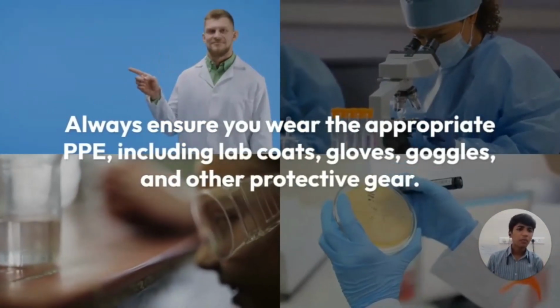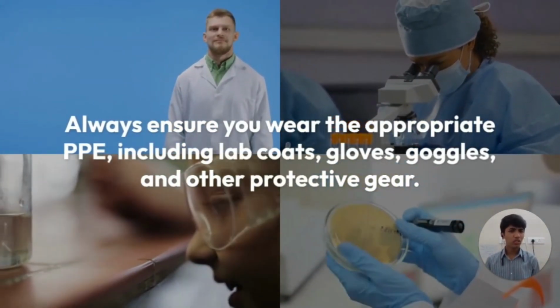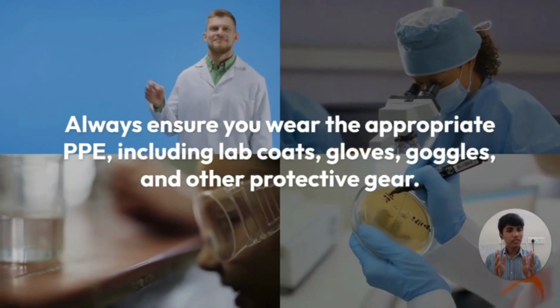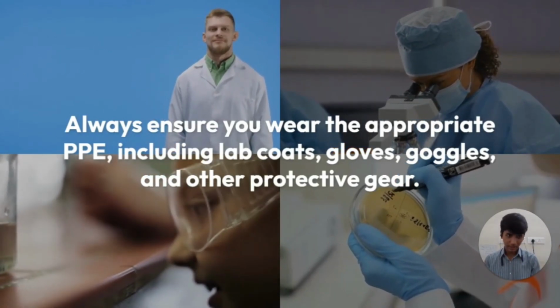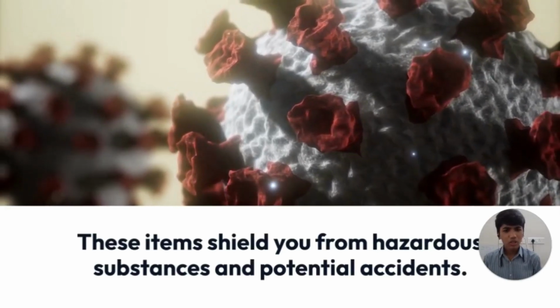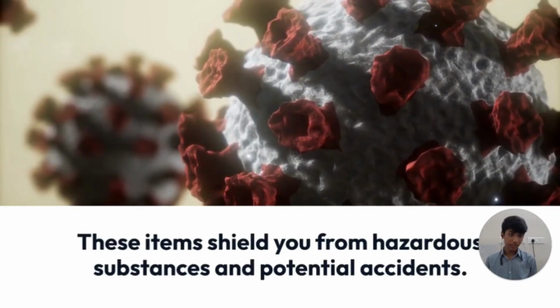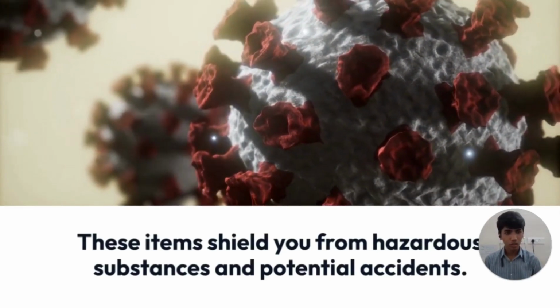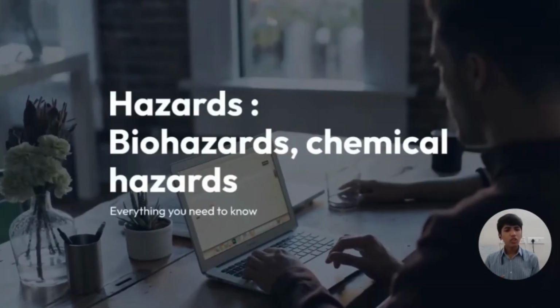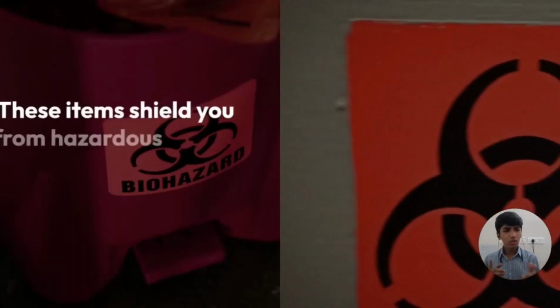Now PPEs. PPEs include lab coats, gloves, goggles, caps, etc., to safeguard ourselves from hazards. For example, in COVID, we used masks. Similar to that, we have to use them in the lab. This will shield us from hazardous substances and potential accidents also. And while doing the experiment, you should use them carefully.